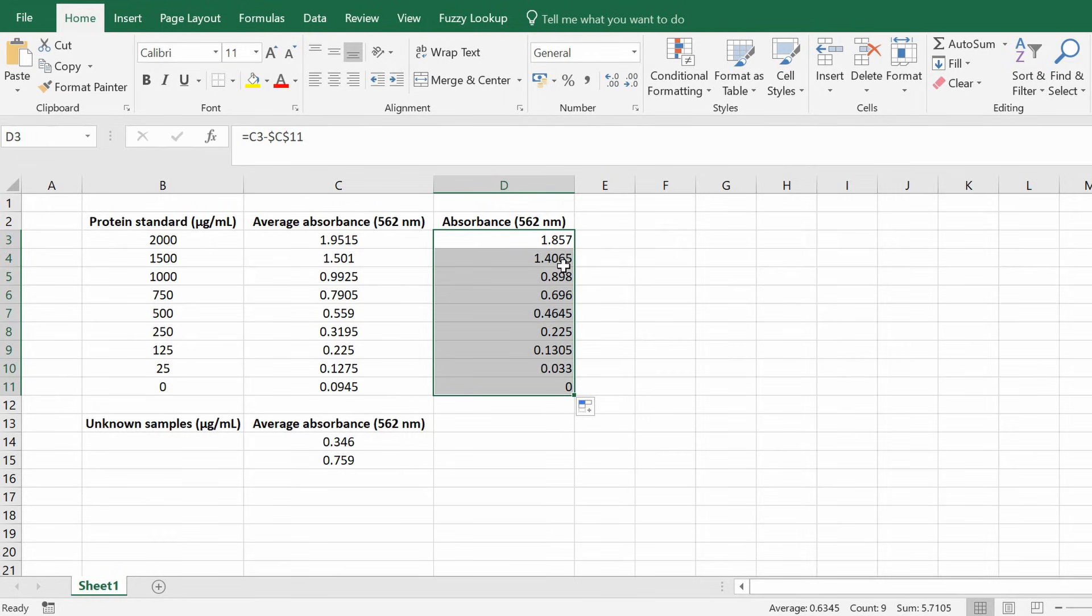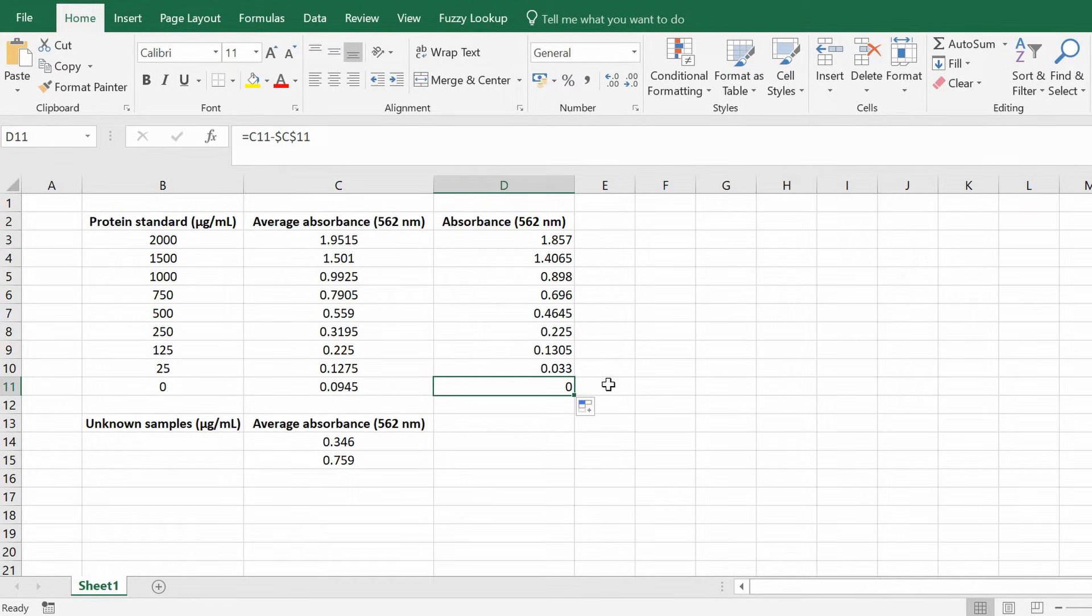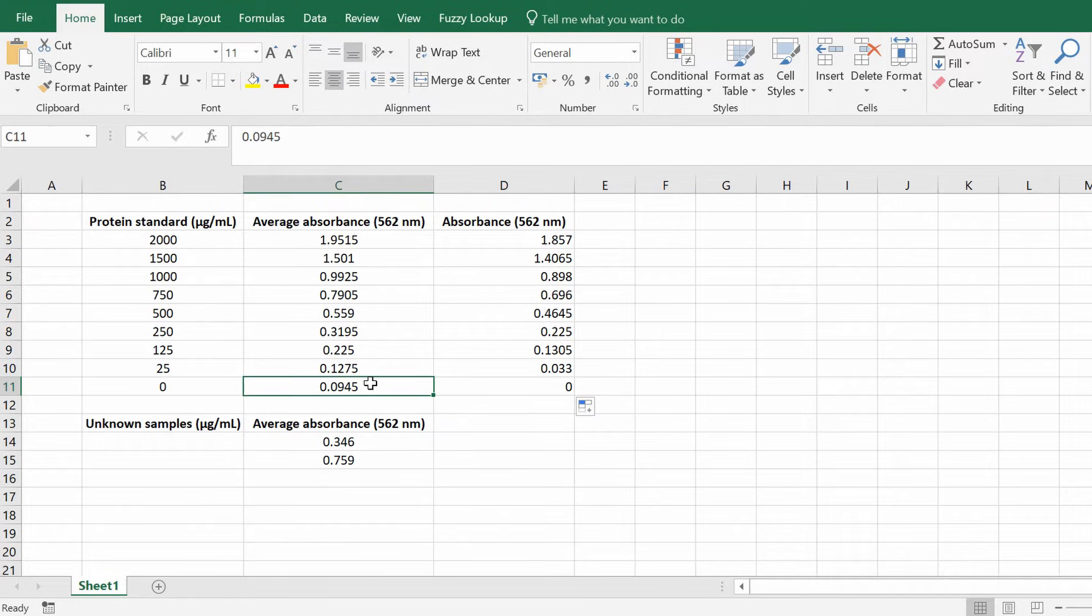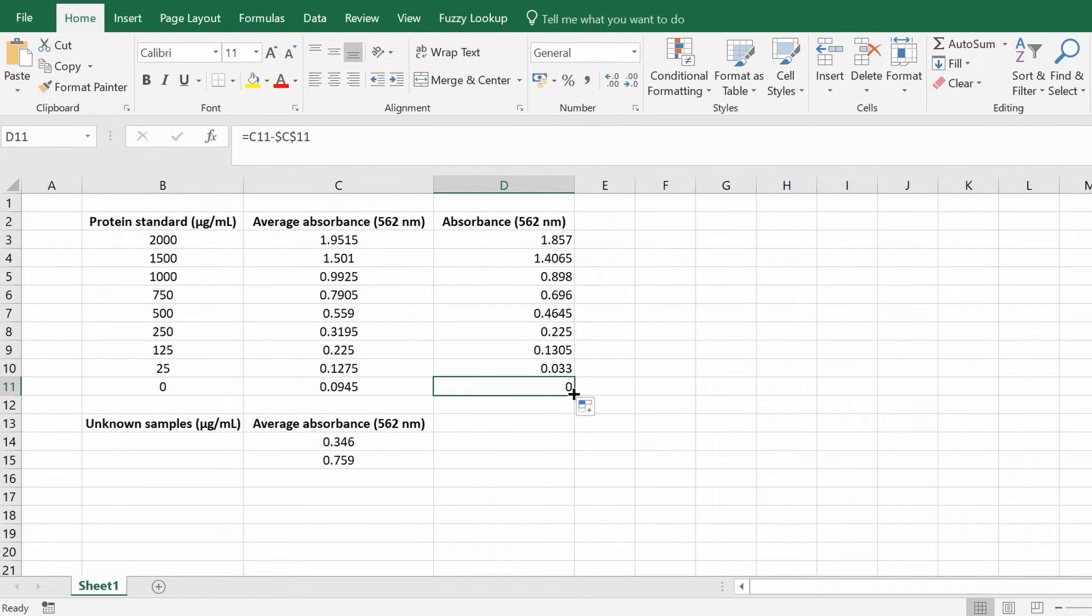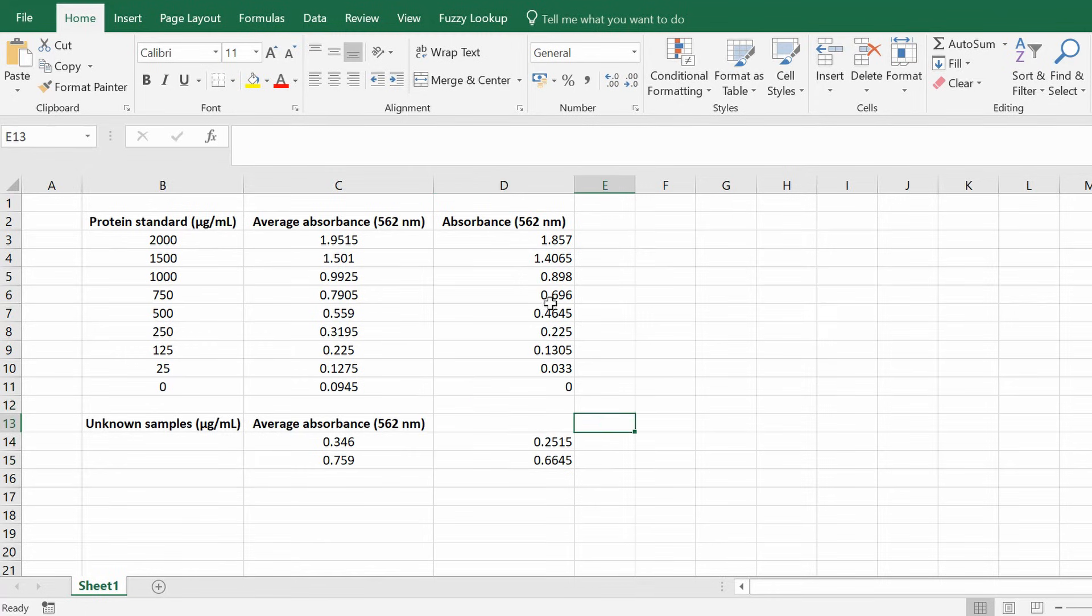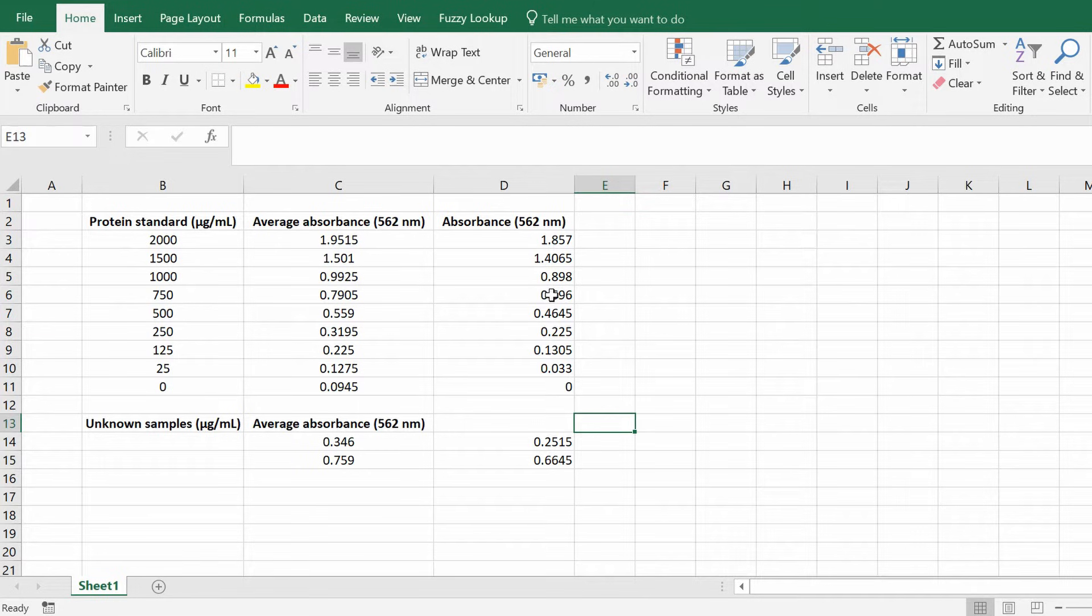So what I'm going to do is drag this down to copy the formula. So as you'll notice if you've done it correctly the background absorbance value should now be zero because obviously taking away 0.0945 from itself is obviously zero and you also want to repeat this for the samples as well, the unknown samples. So now we've got our background corrected data. So the next thing is we need to create a linear standard curve.